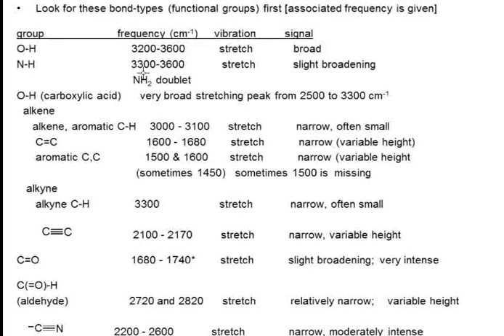All right, as we proceed more towards the right end of the spectrum, next we want to look for the possible presence of a C-C double bond in an alkene or an aromatic ring. So the place you want to look is between 3,000 and 3,100 wave numbers. If you have an alkene with an alkenyl hydrogen or an aromatic ring with hydrogens bonded to the ring, and that's almost always the case for an aromatic compound, you should see a peak between 3,000 and 3,100. Remember that 3,000 is a dividing line.